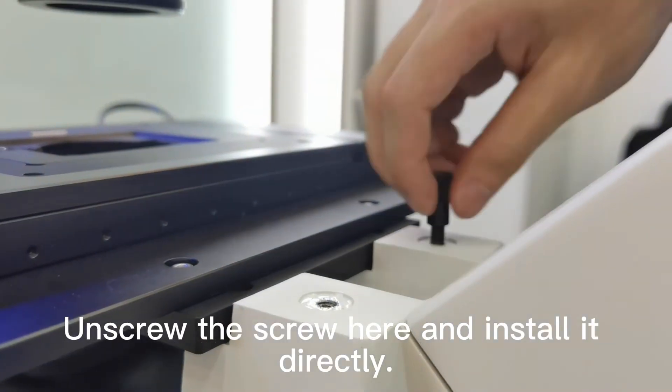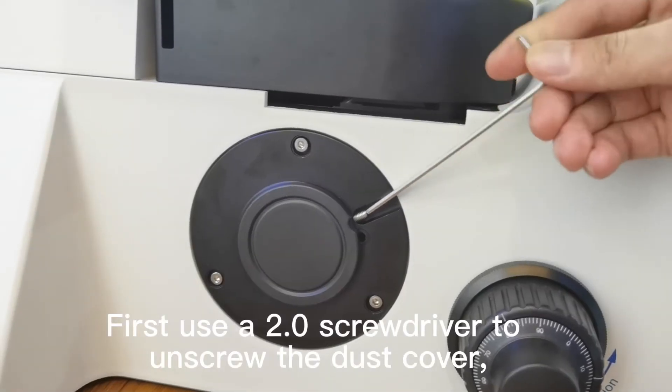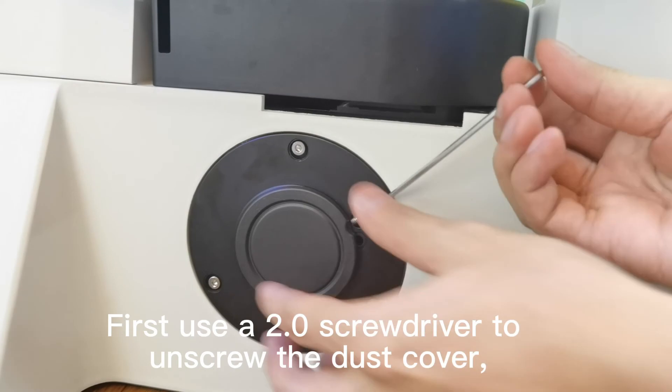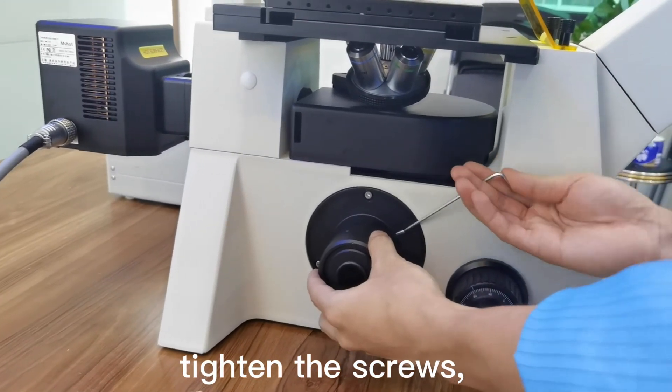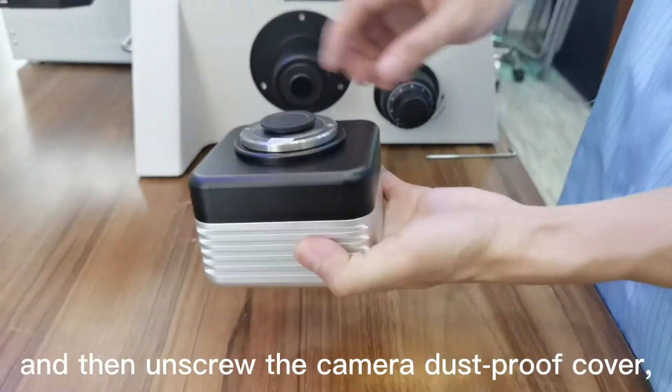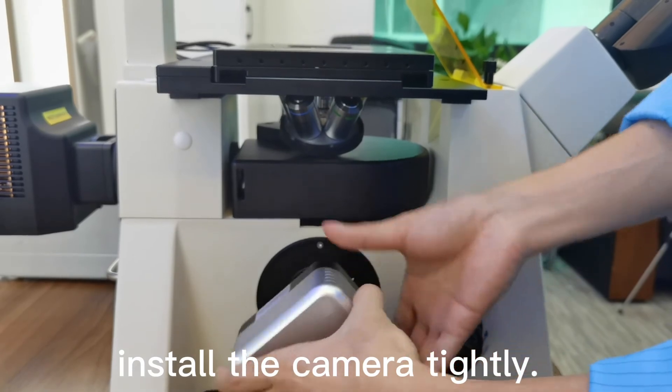Unscrew the screw and install it directly. First use a 2.0 screwdriver to unscrew the dust cover. Install the interface and tighten the screws. Then unscrew the camera dust-proof cover and install the camera tightly.